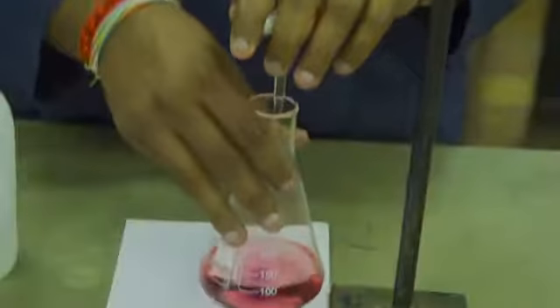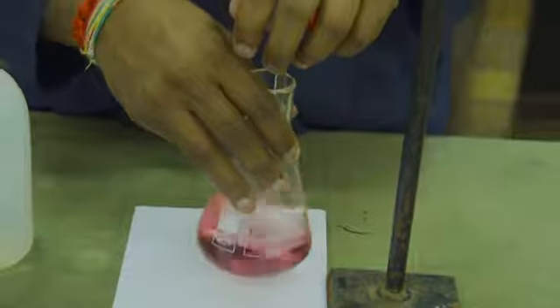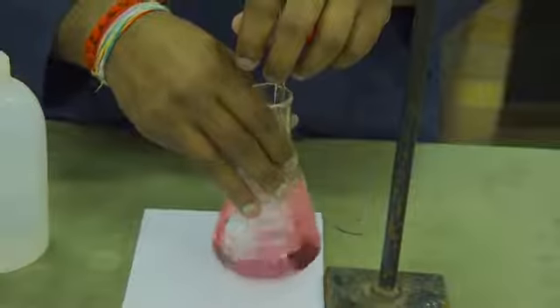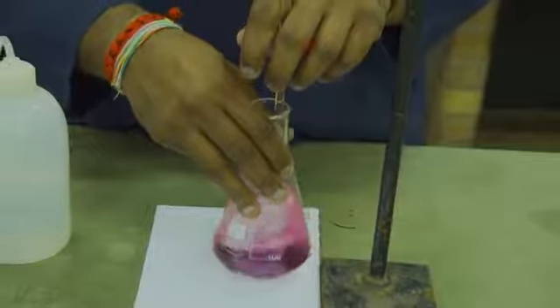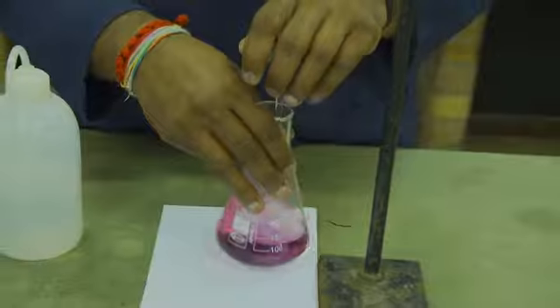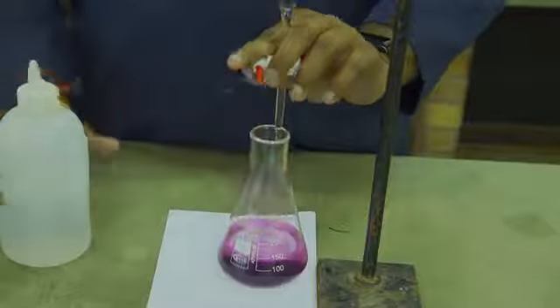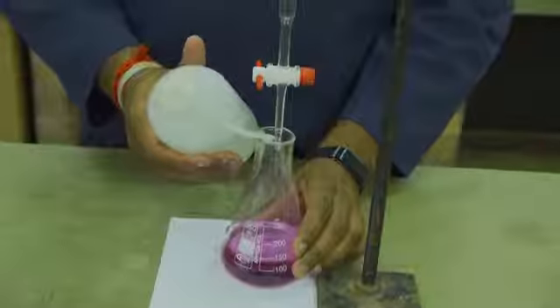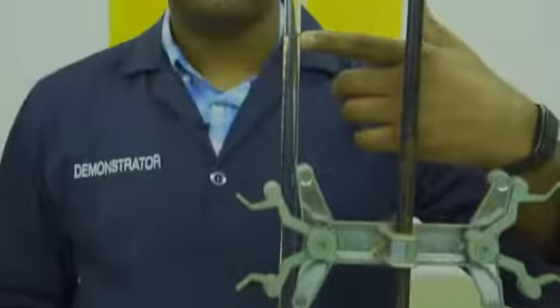As done in part A, you will record your initial volume on your burette. Thereafter, you will start your titration. The pink color will change to a purple color. You will then wash the jet with some deionized water and record your final volume.